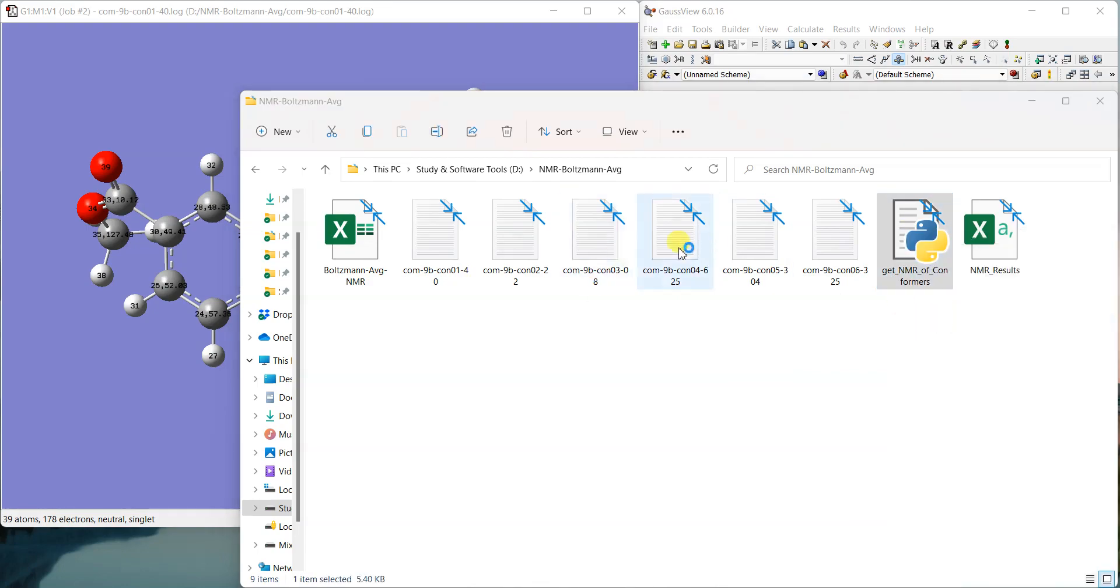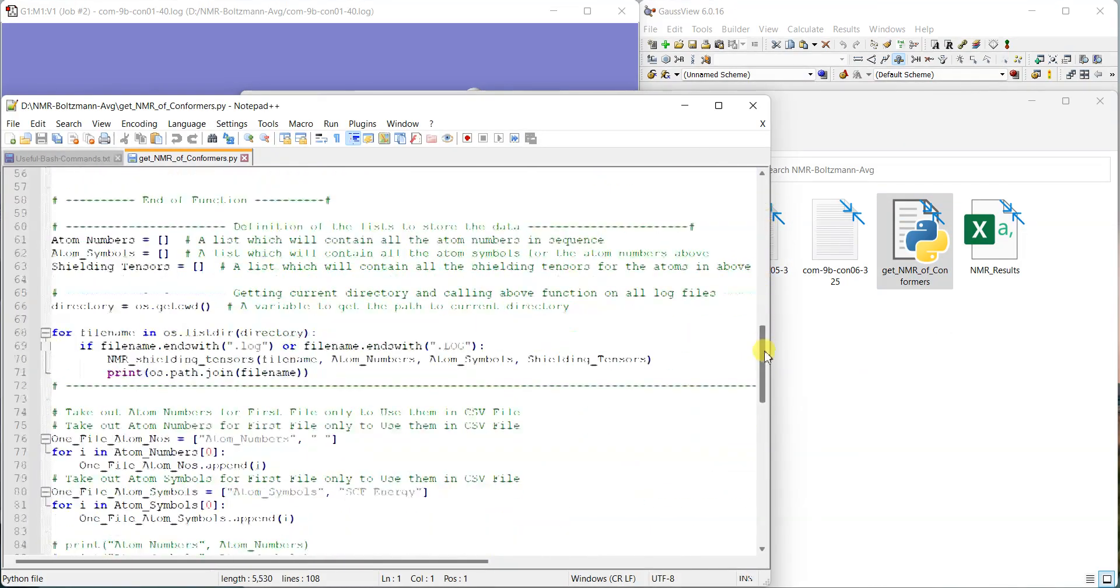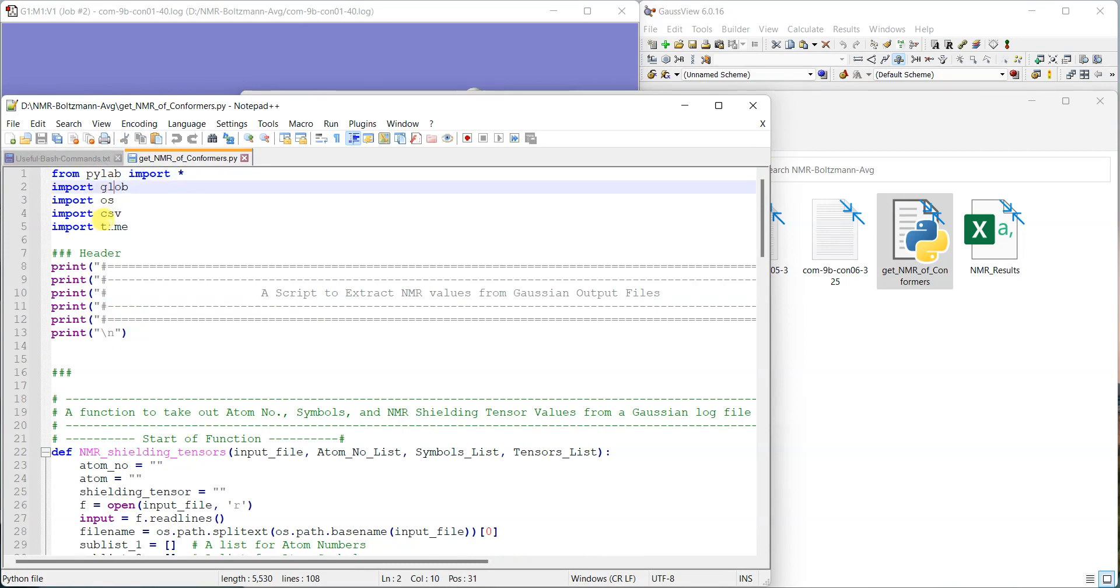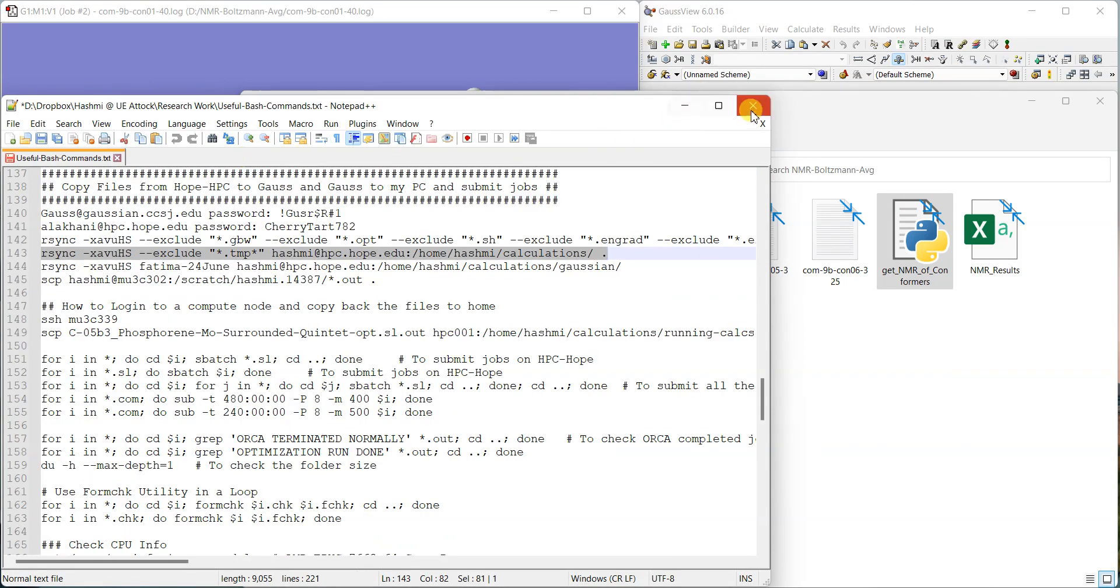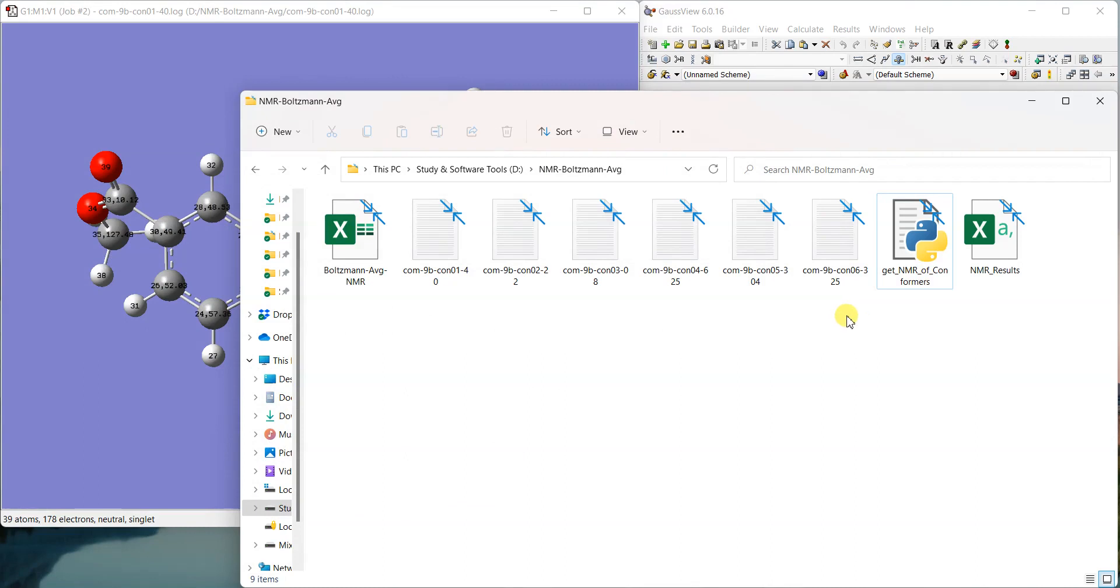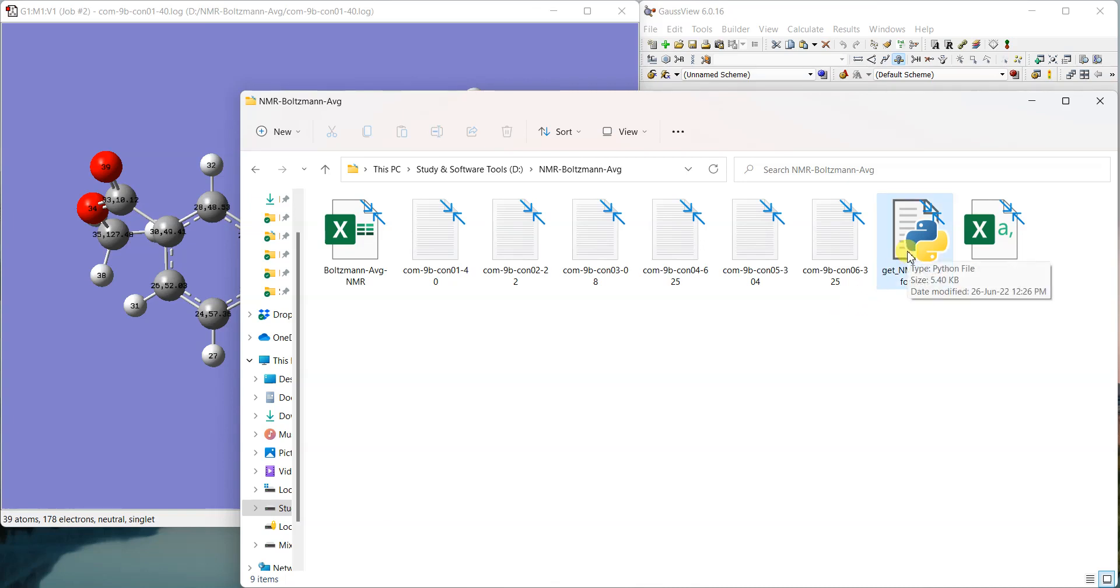First of all, have a look at this script here. For this script to run, you should have these different modules installed: PyLab, Glob, OS, CSV, and Time. To run this script, I definitely prefer Linux because that's very easy to use with the script. You can also use it in Windows—you can simply double-click if you have Python installed in Windows.